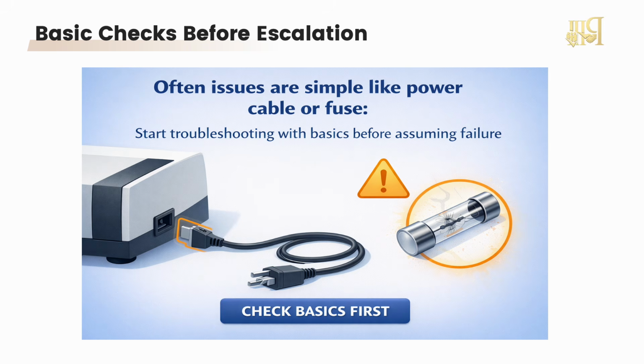But let me ask you something very basic. Did you check the power cable? Did you check the socket? Did you check the fuse? I have personally seen situations where operations stopped for hours and the issue was simply a loose connection. Now understand this clearly. This is not an instrument failure, it is a thinking failure. So what should you do? Always start with the simplest possibilities. Check power, check connections, eliminate basics, then escalate. Because good troubleshooting always moves from simple to complex.